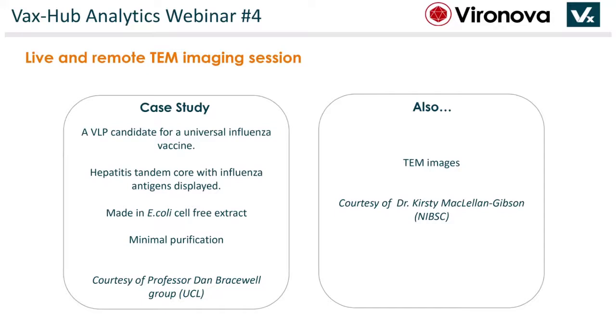Although these images are not of VLPs, they have a high level of complexity, which will be very useful for us to visualize, because we can make an analogy of the challenge of doing this type of image analysis, and how we would understand what is our particle, what is an aggregate, debris, or any other issues that are not what we want.